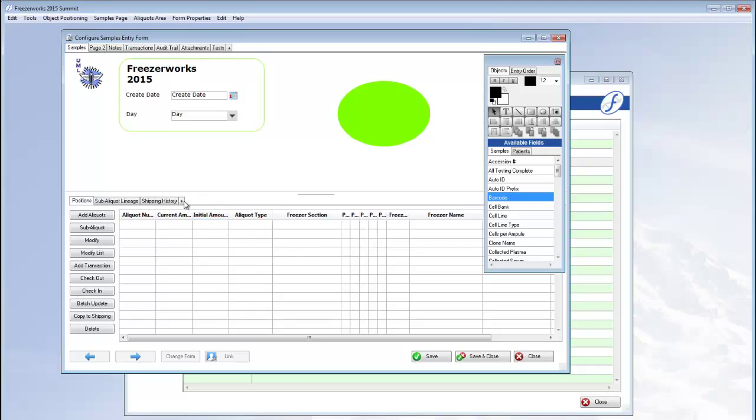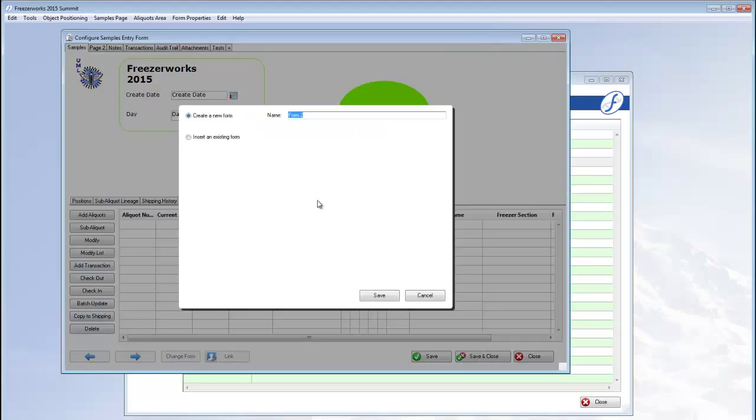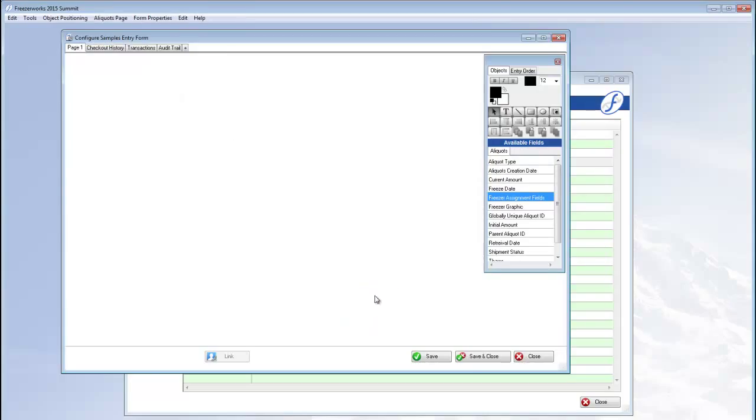The plus sign in the aliquots area will add another aliquots form to the current samples page. These aren't like aliquots pages, but actually entire forms that you can add fields and more sub pages to.